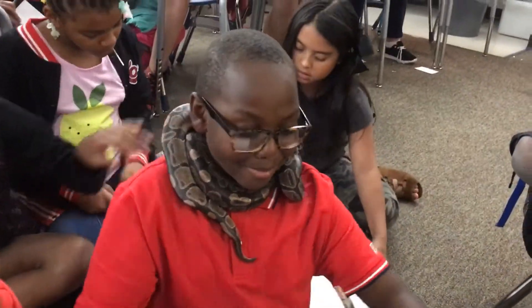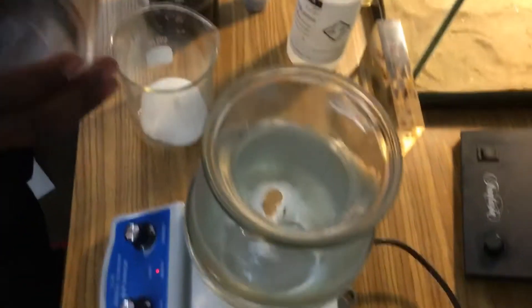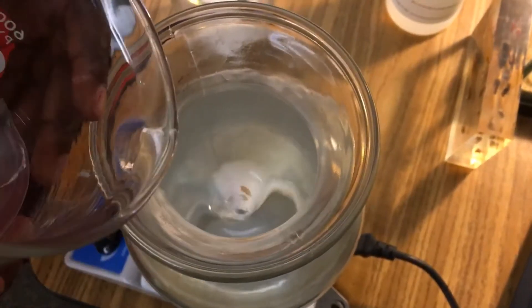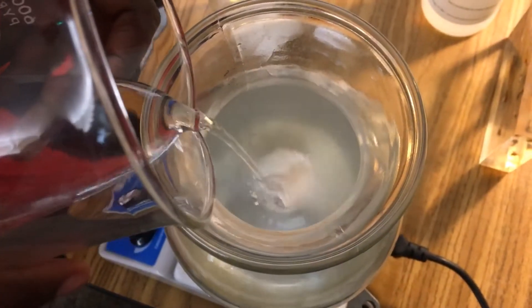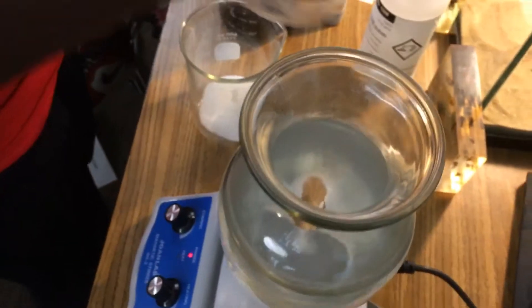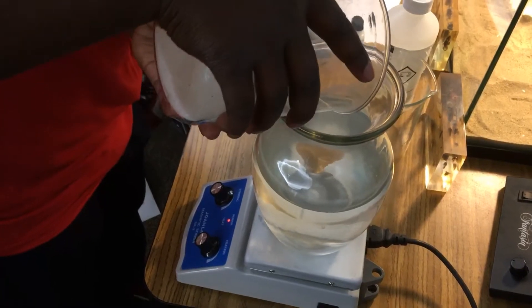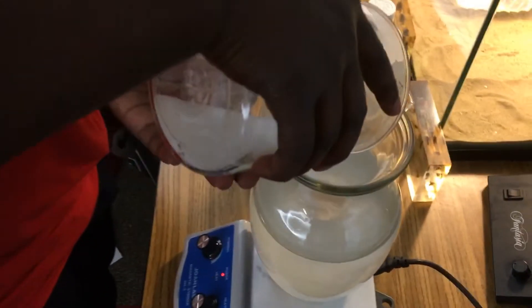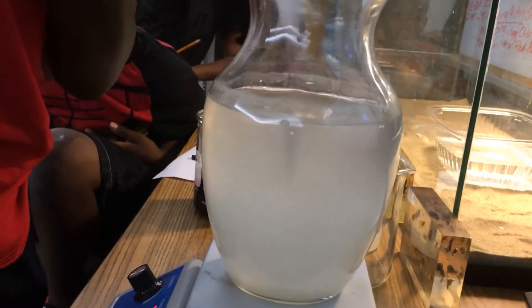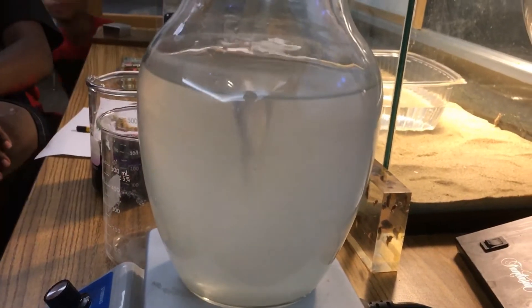We're gonna ask Caleb to add first the sodium hydroxide and the sugar. Caleb, go ahead and pour this slowly into the vortex so it doesn't disrupt it — slowly pour it in there. Now he's gonna add the sugar. Pour that in and we gotta wait until the sugar is completely dissolved. That's where the stir plate really helps out a lot.